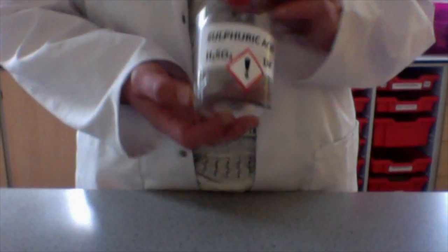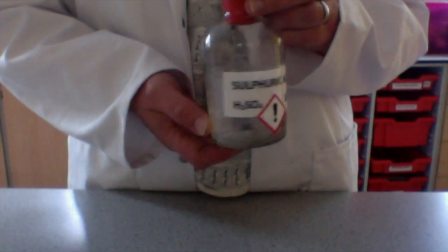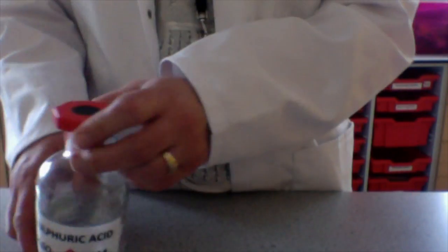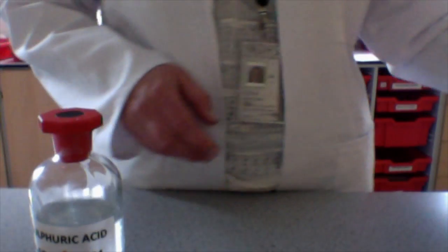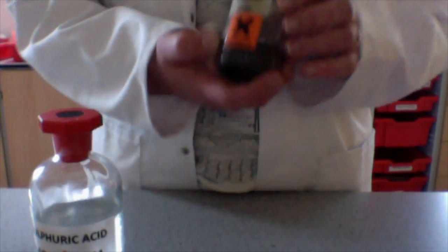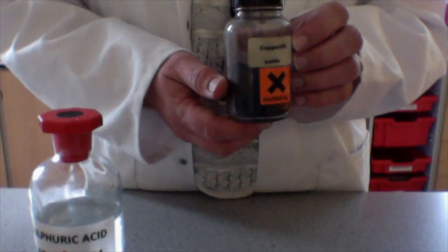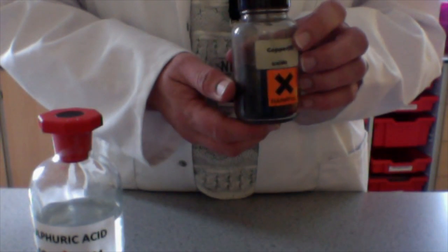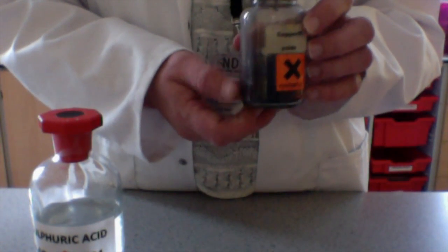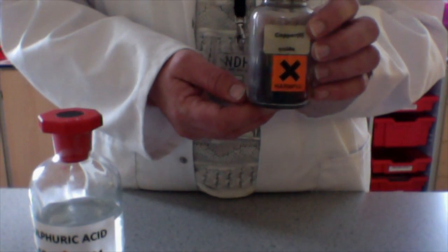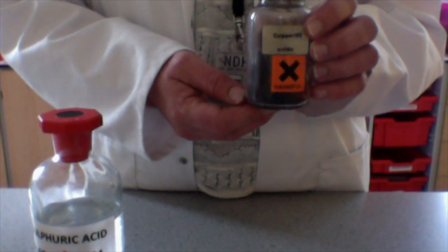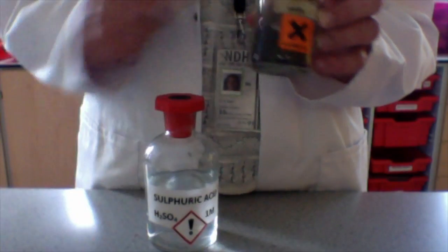Another way to make a soluble salt is again to use an acid. I've got sulphuric acid here again. But this time, I'm going to react it with a metal that has already reacted with oxygen, so I'm reacting it with metal oxide, with copper oxide powder like this.